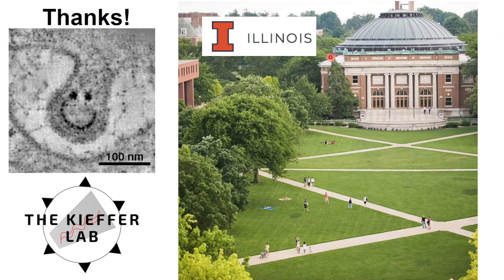And then in some of your CNS work, can you say microglia versus T cells? Right now, we have that up and running. It's not ready for the public to see yet, but we have assays up and running. We can definitely detect microglia, we can definitely detect astrocytes, we can definitely detect other potential immune cells. So we have all the markers ready to go, and we just haven't done those experiments completely yet. That's something we're really interested in, because that's another uncharted territory: who's infected and who's producing virus.